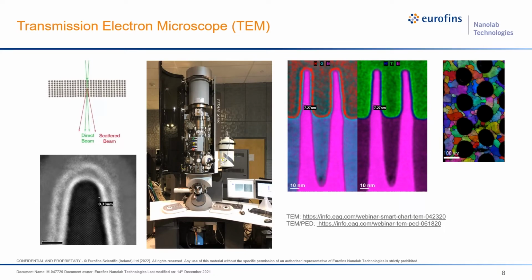Here, just some basics about TEM. We provided 2 webinars on TEM recently: one more general discussion, and the other on TEM application in crystallography analysis. Please feel free to check our website for these recordings. Today, we will just give a brief introduction about TEM, and we will not go into too much detail about TEM imaging, sample preparation, etc.